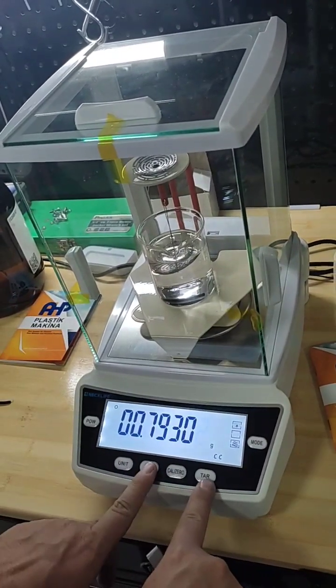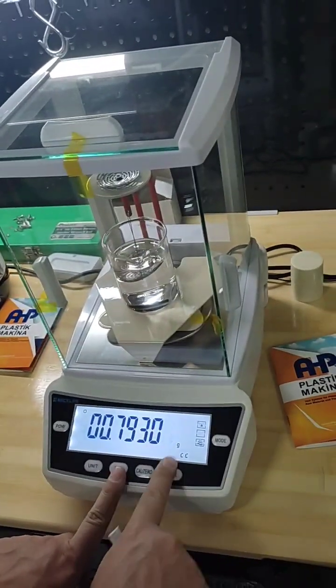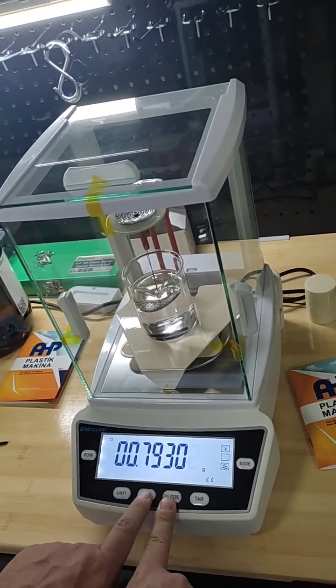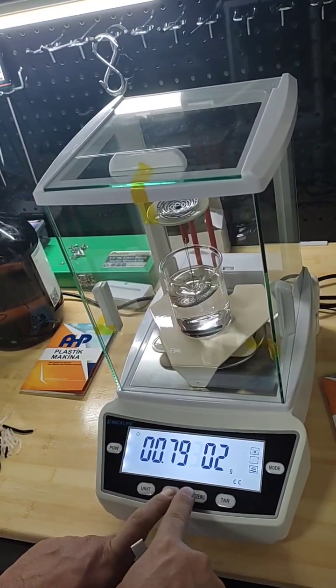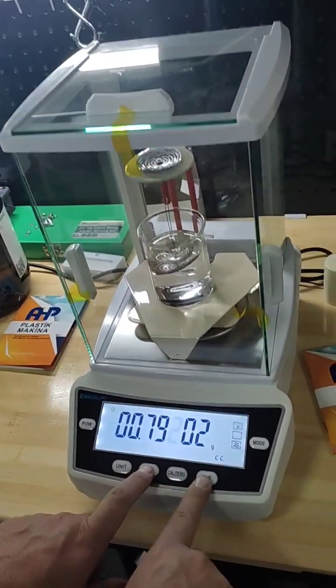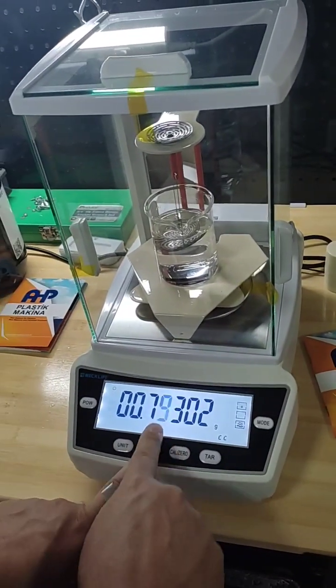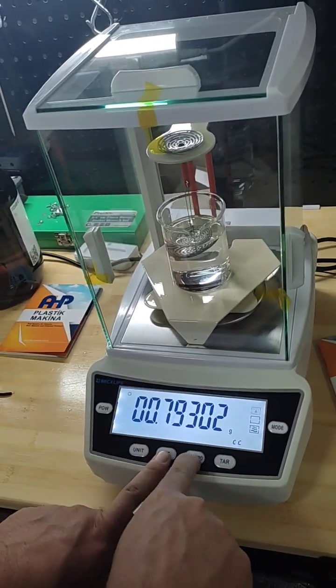You can change this number using these three keys. Tar is reducing the value and cal zero is increasing it and print is selecting which number you're going to change. You see tar reducing, cal zero increasing.